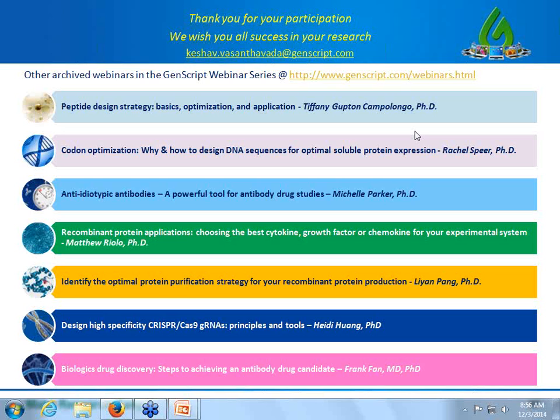So in case you're wondering what kind of linker, typically a combination of glycine and serine works really well. It's worked really well for me, and if you look at published sources, there are all sorts of linkers people have tried and they've worked really well. But from my experience, a combination of glycine and serine seems to work really well. Again, I have mostly used TEV. I don't like thrombin as much. TEV has worked really well. So about 8 amino acids before TEV, another 4 or 8 after TEV seems to work really well.